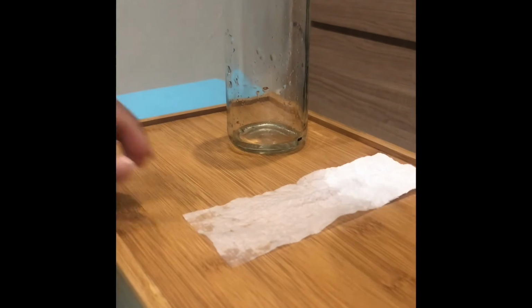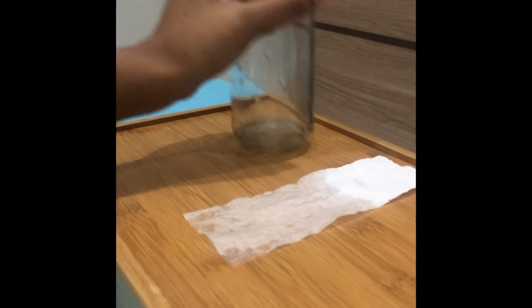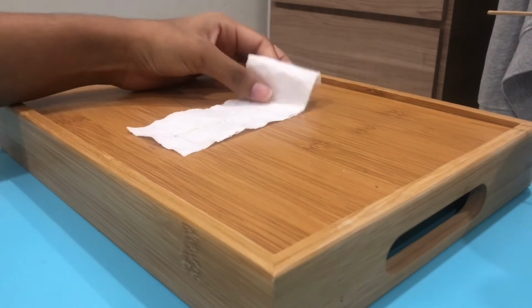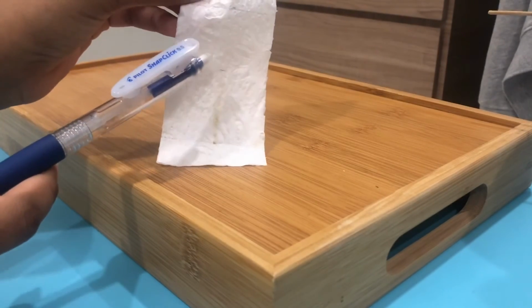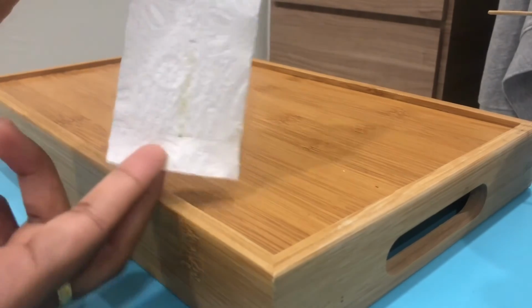Okay, so now I'm taking it out from the chamber and letting it sit here to dry for a bit, because it's past the line of the 5 centimeter that I've marked. And then after it dries, we'll measure how far the pigment has traveled. Okay, so after allowing the TLC plate to dry for about 15 minutes or so, I decided to see how far the pigment traveled. And you can see I've also measured and marked a small pencil mark there to show how far it traveled. It's not very pigmented, but it traveled quite a bit.